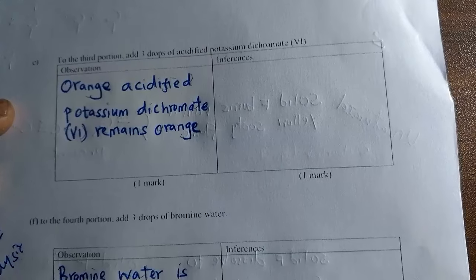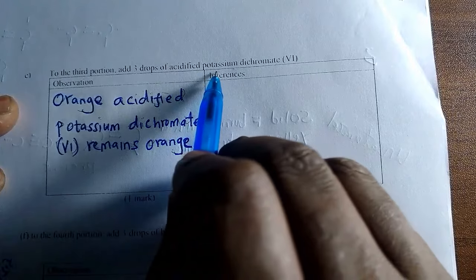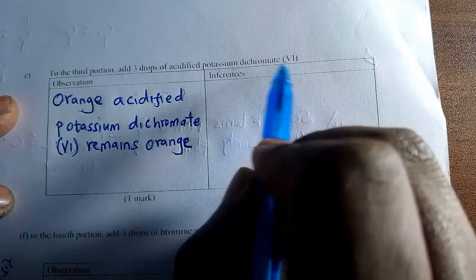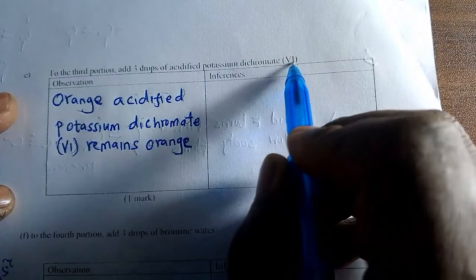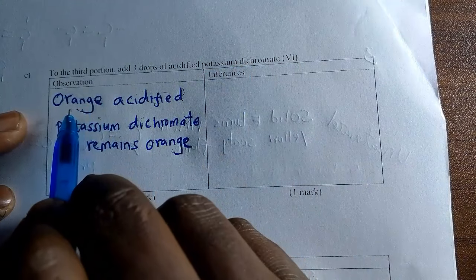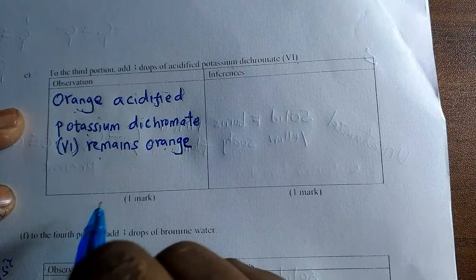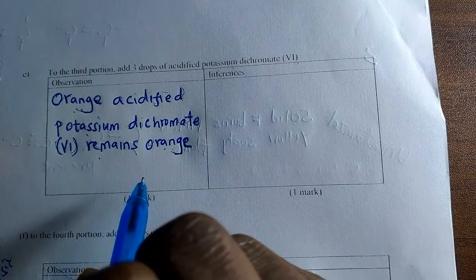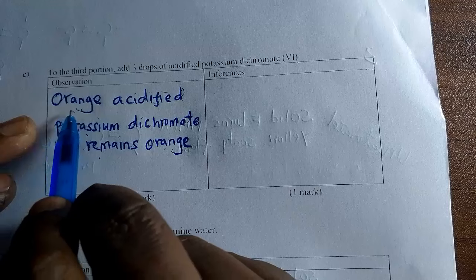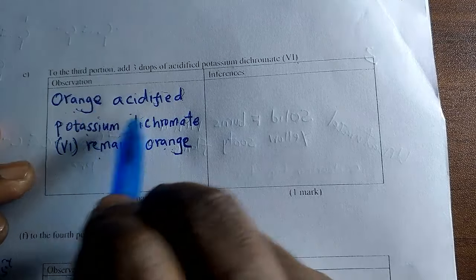To the third portion, add 3 drops of acidified potassium dichromate 6. The color of dichromate 6 is orange. So orange acidified potassium dichromate remains orange. It means the color persists. Don't write nothing happened. The orange color of acidified potassium dichromate remains orange.